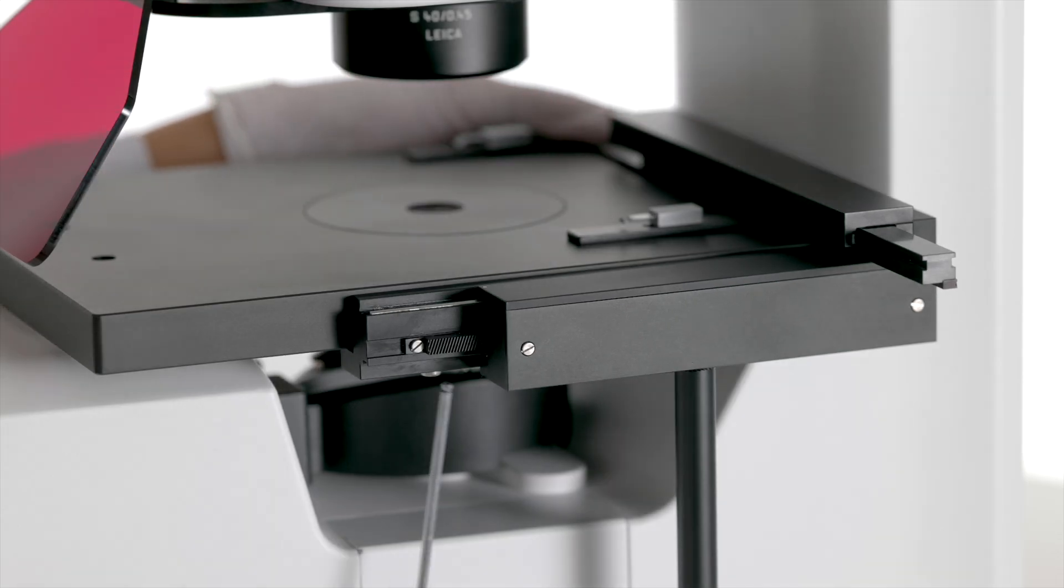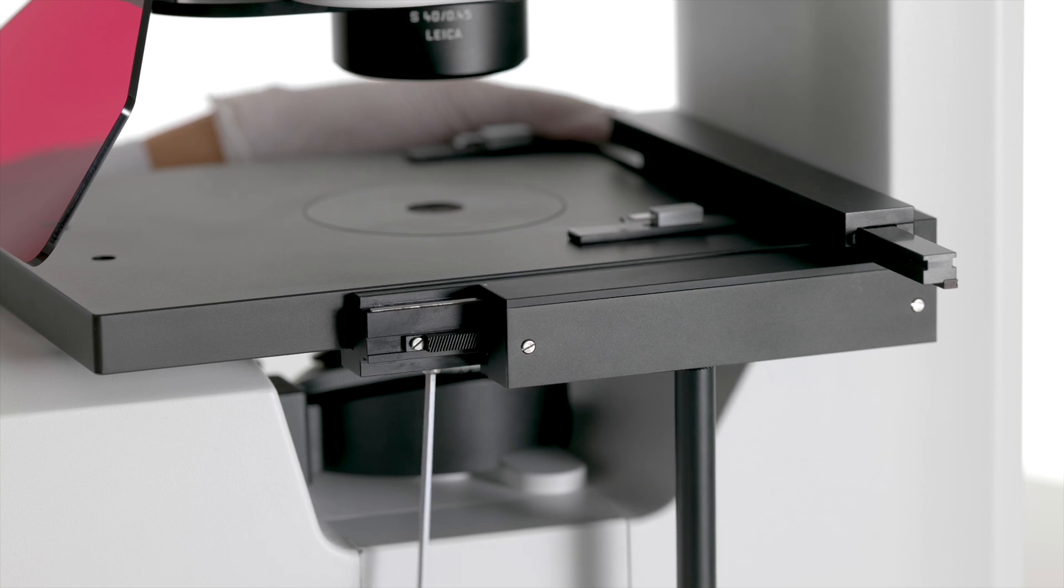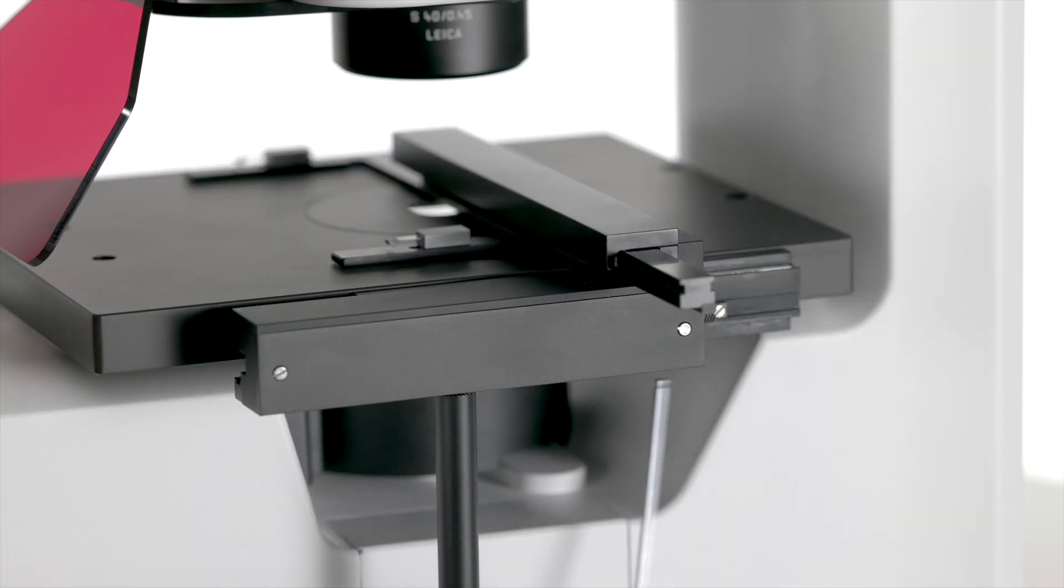When installing the object guide and holding frame, the first step will be to align the two hexagon screws of the object guide with the two holes under the stage. Now screw them in until they are secure against the stage.